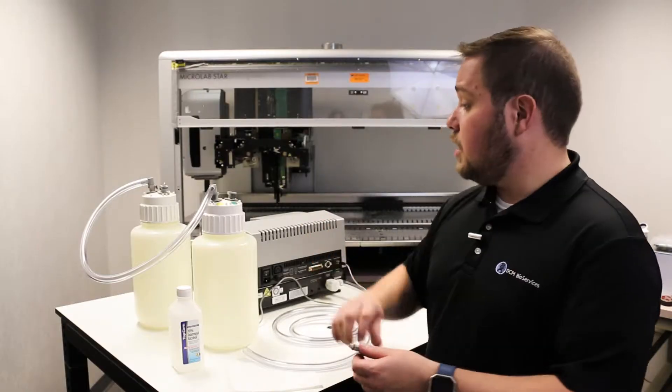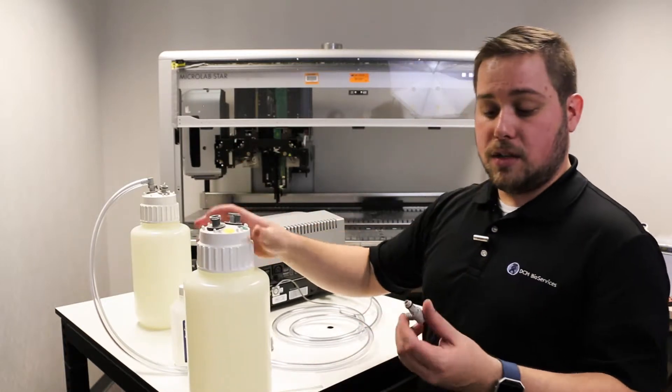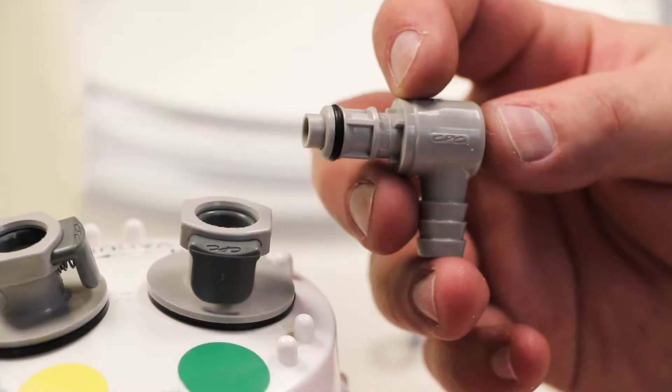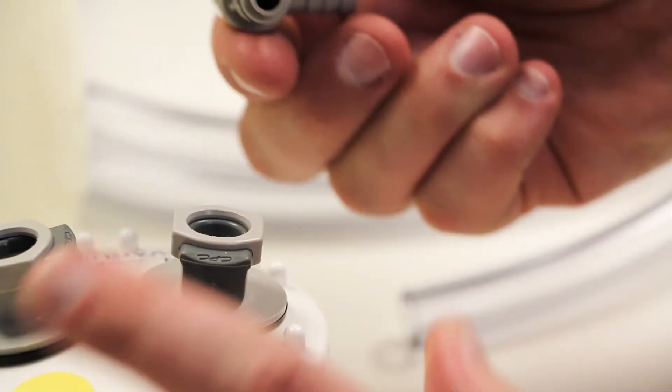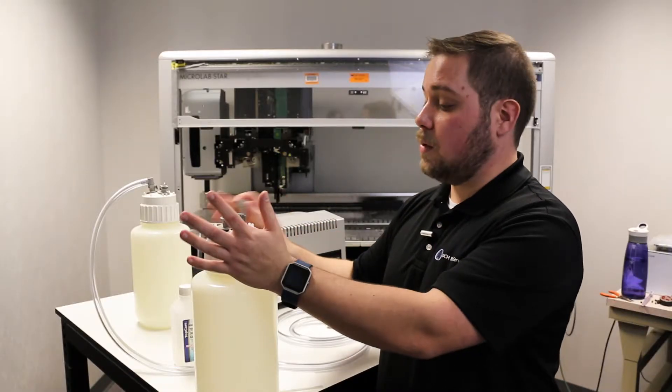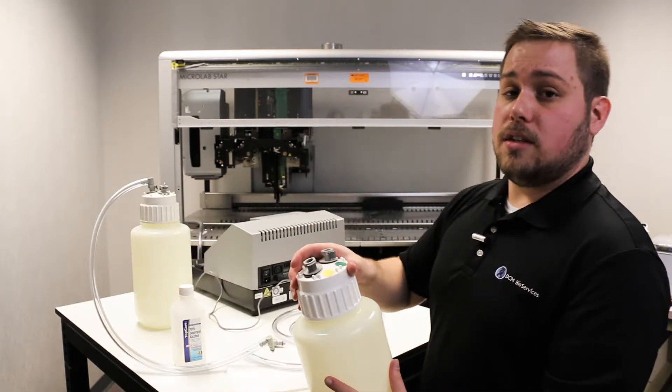Be sure to check the fittings on your waste line system regularly. Male fittings should have a nice clean o-ring on the bottom and fit in with a nice snap to the female fittings. Female fittings should eject the male fitting without any extra pull. These should also be tight to the cap.